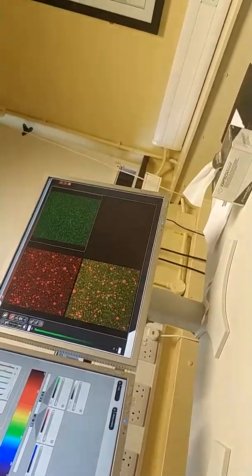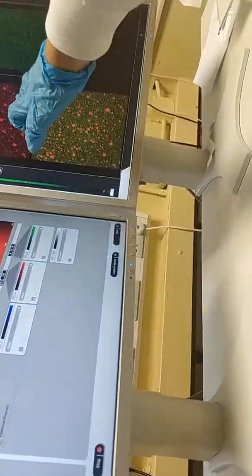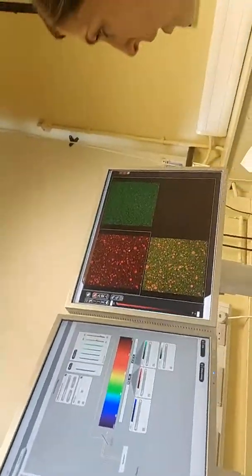So now you can adjust the gain a little bit. I would put a little bit more. So they are the fat droplets. What's the small thing? Are they noise? The small ones can be either noise.